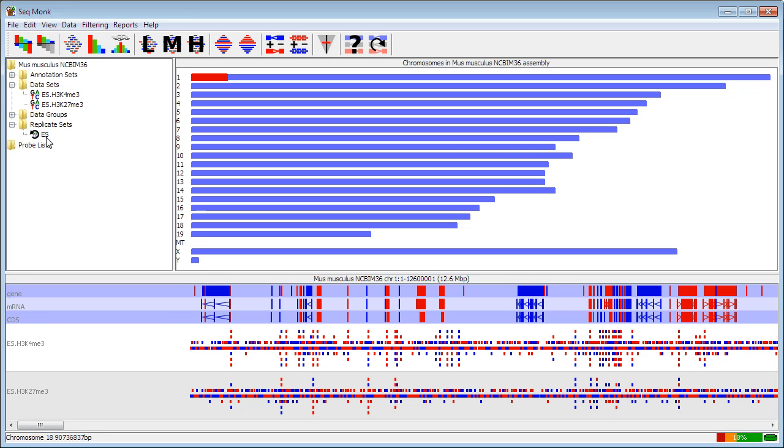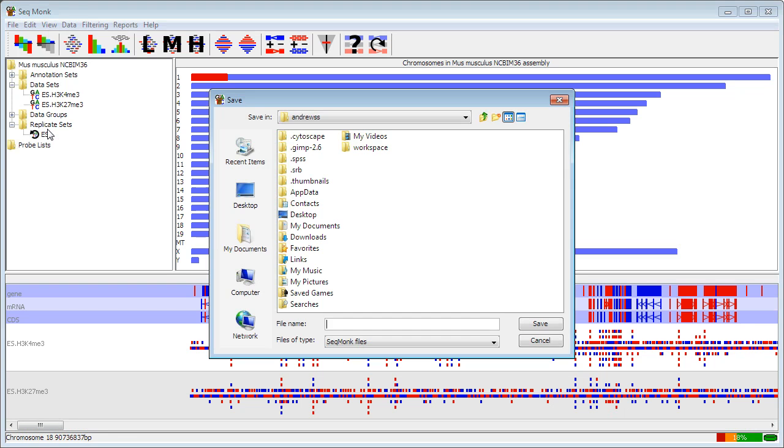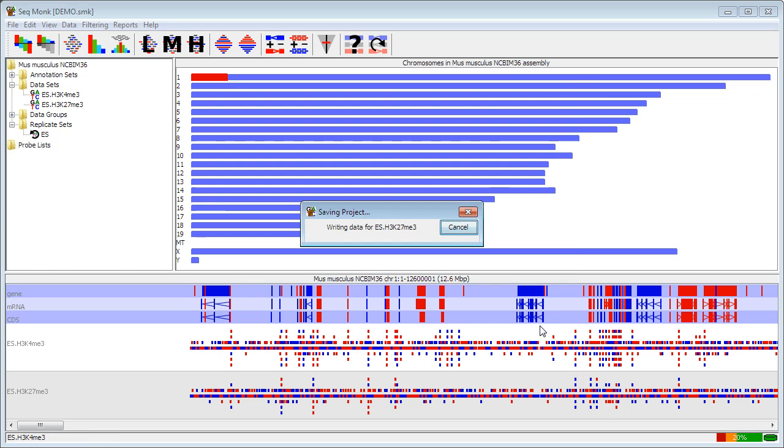At this point, having imported all your data, it's probably a good idea to save your project before you go any further. So to save a project I simply go to File, Save Project, select where you want to save it to, and save.